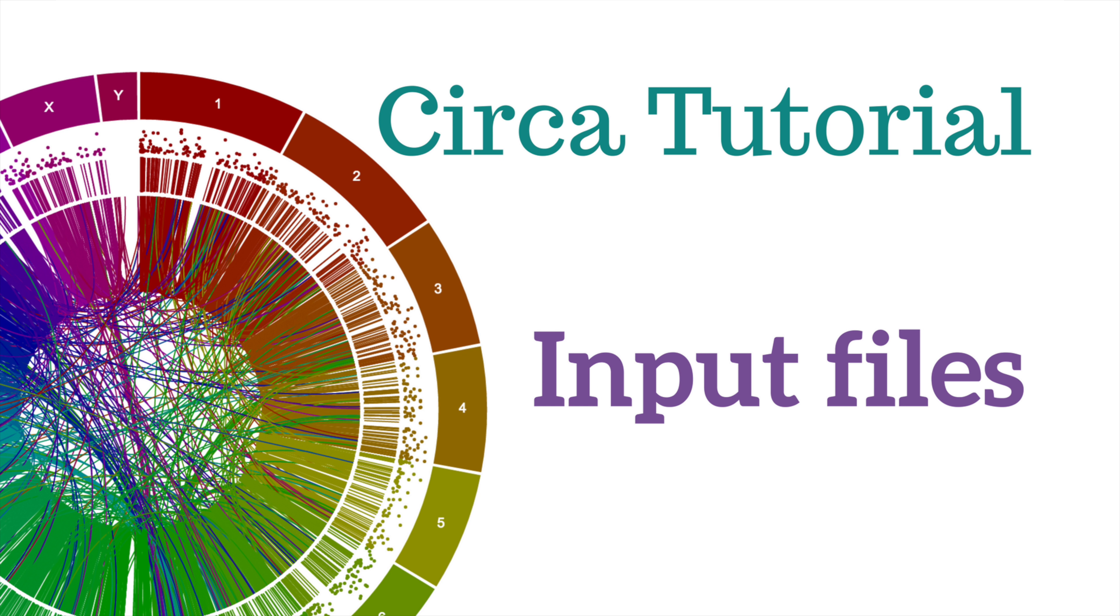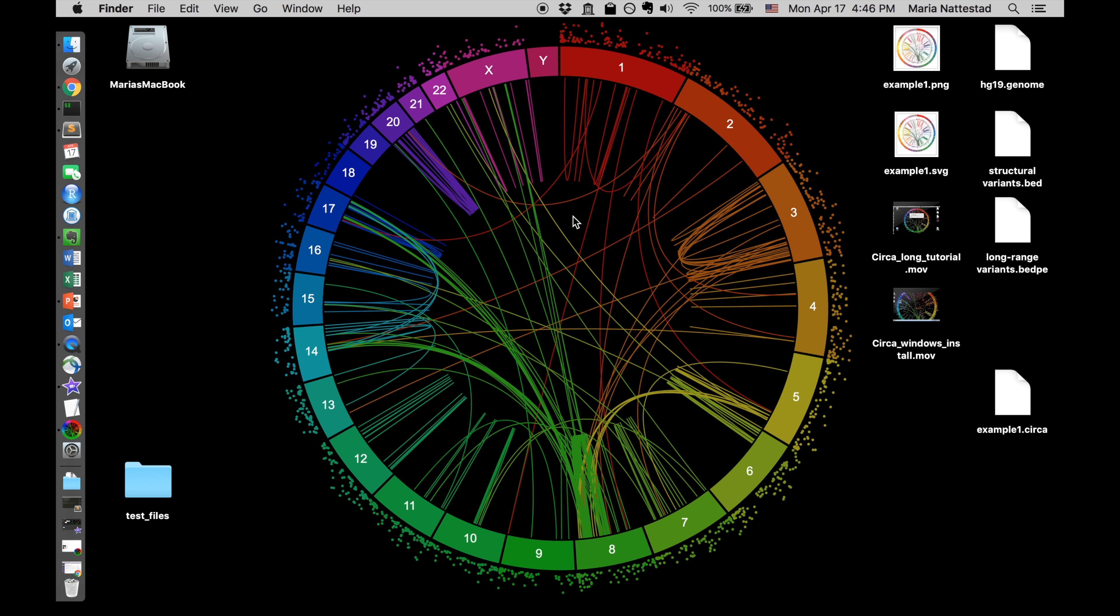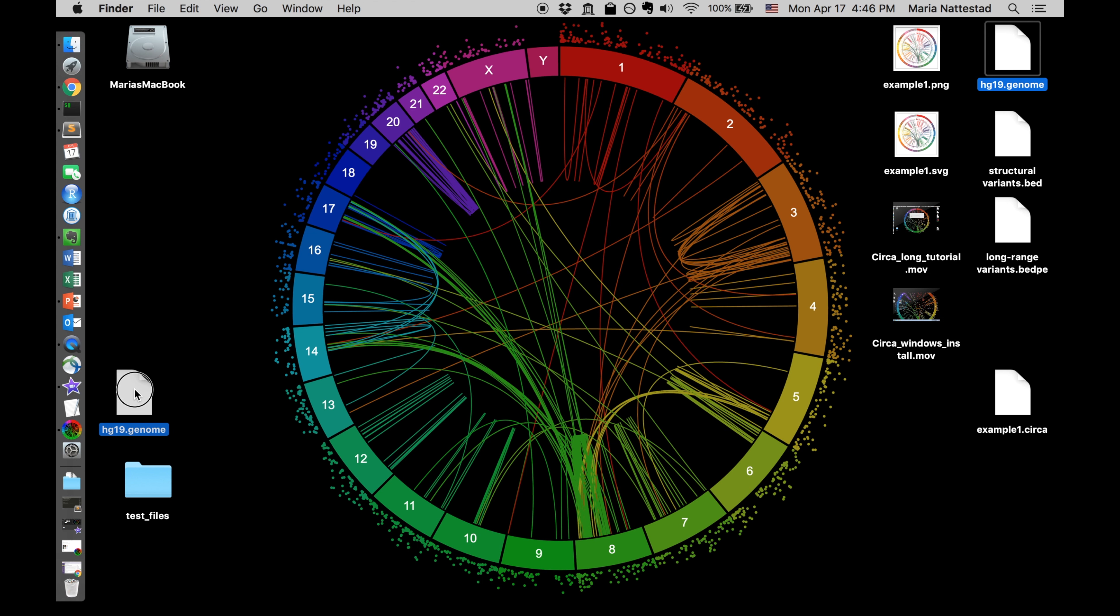You can load all sorts of different files into CIRCA as long as they have rows and columns and are either comma or tab delimited, or possibly also with spaces.